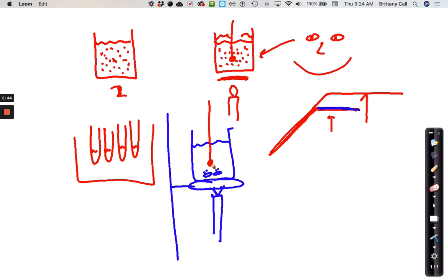So as soon as it starts to boil, as soon as it starts to remain constant, that's when you want to go for 2 minutes. You want it to be constant for 2 minutes. Okay? Good. Great question. Are we good? No, you don't have to time how long it takes to get to boiling. Just time it at boiling. If it stays constant for about 2 minutes, you found that boiling point. Good. Okay, then we're ready for step 5.